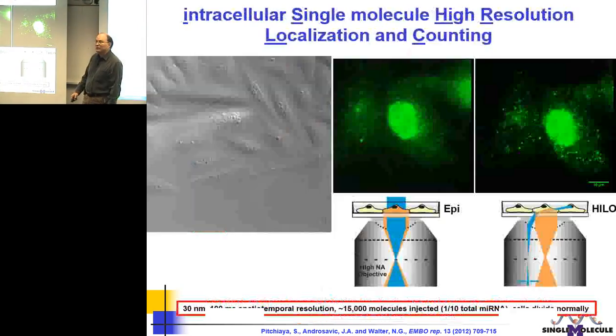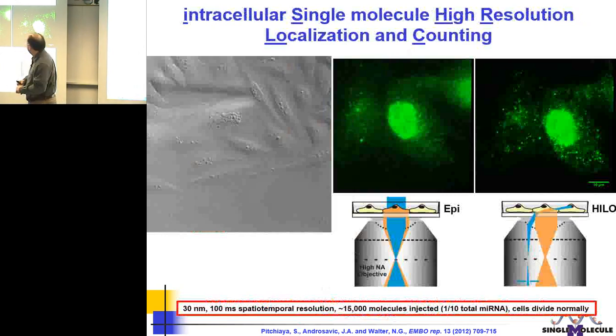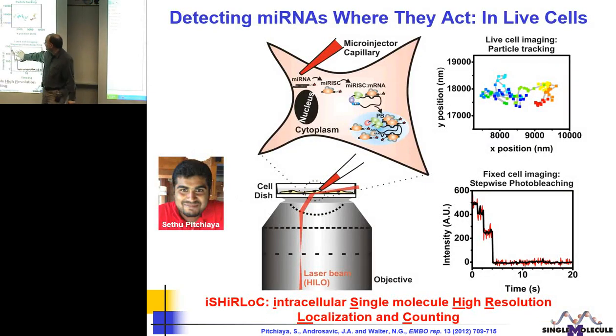Shouldn't all the steps have a similar height? Not necessarily, because it depends on the optical configuration whether they would appear of the same brightness. It's rare, actually, that they have exactly the same height. So what we use is whether or not there's a step above a certain signal to noise. That's the readout. In general, you may know that fluorescence is not inherently calibrated, it's a relative signal. It depends on geometry, where it is in space, and amplification. And so the signal intensity does not scale linearly with the fluorophore number, but the number of steps does.